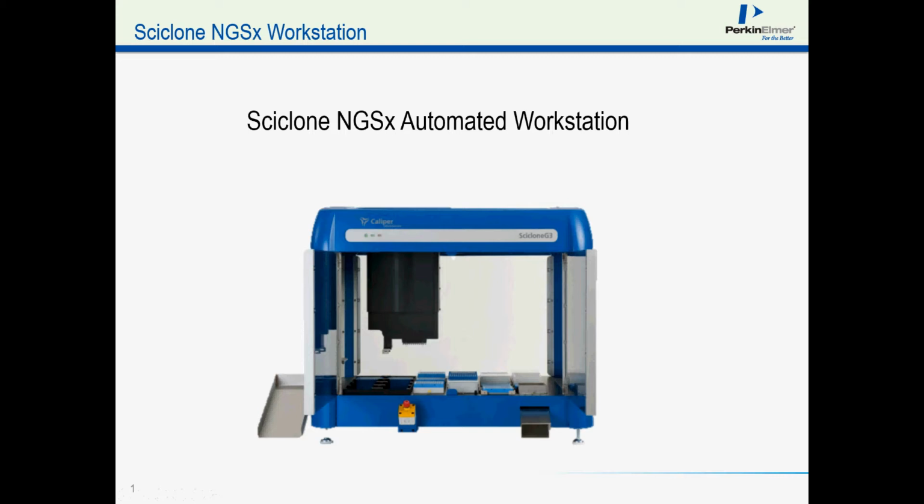Today I wanted to give you an introduction to the Sciclone NGS X, as well as the software that is used to control it.